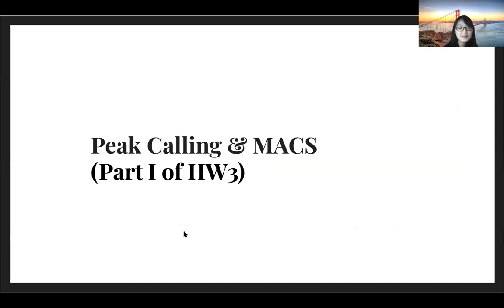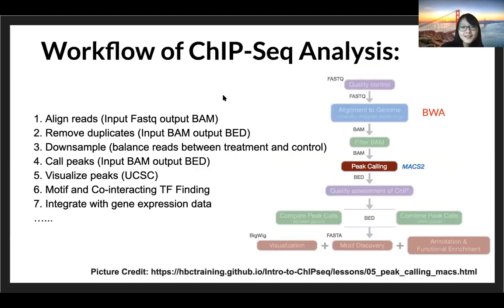Now I'll go over part one of homework three, which is about the initial processing of ChIP-Seq data. We use a lot of MACS. Here is a general workflow of ChIP-Seq analysis. We send ChIP-Seq library for sequencing, and a company like Illumina would return us FASTQ files. It's also the starting file for your question one. Then we want to align the FASTQ file to human genome, which will give us BAM files. Then we want to do some quality control and perform peak calling using tools like MACS2. That will give us a BED file. You might want to do quality control again, and then for downstream analysis there will be motif discovery, co-interacting TF finding, and maybe integrating with RNA-Seq data and so on.